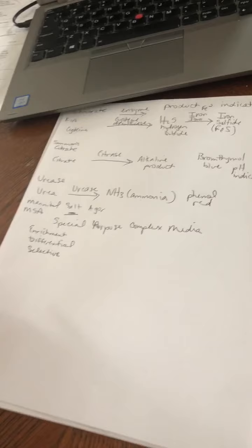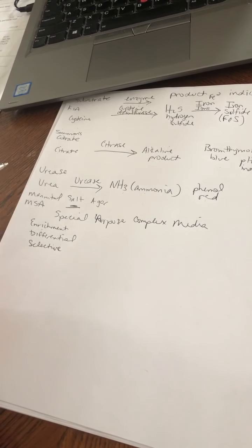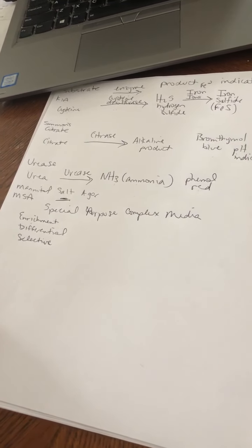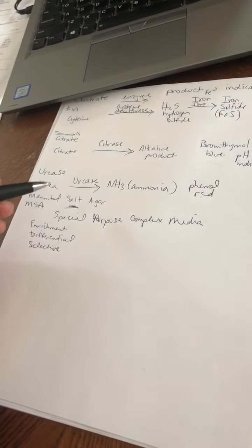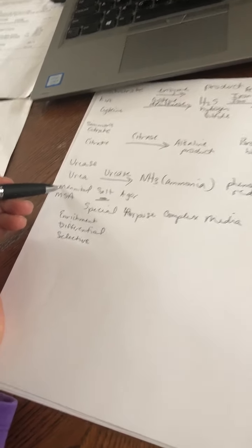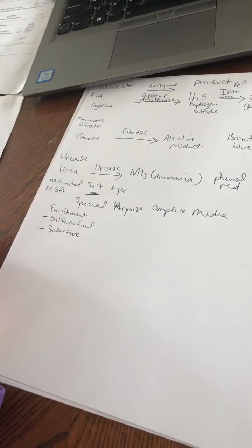in real life. And I really wish you could have seen it in real life. We would have done this with our unknowns, and then we would also have done a skin swab to see what kind of bacteria we could pick up from our skin and if it would change it a different color. But anyway, there's three different kinds of special purpose complex media. Mannitol salt agar happens to be two of these. It's both differential and selective.